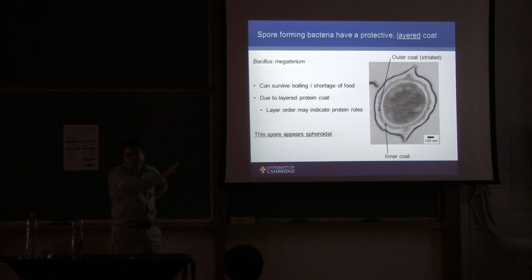But the interesting thing from a super resolution microscopy point of view about the spore is this grey armoured coat, which protects them from the environment.